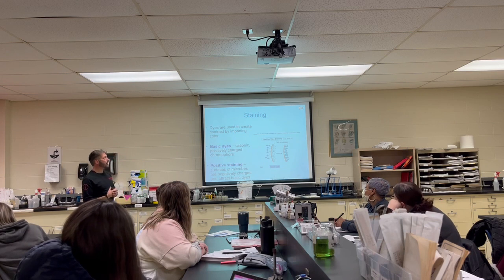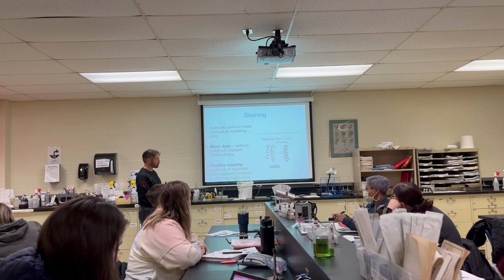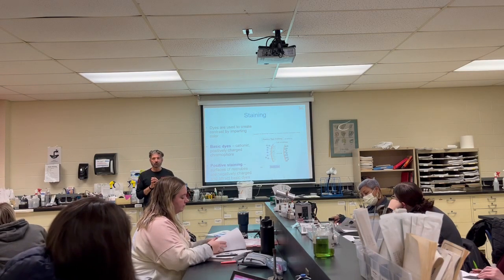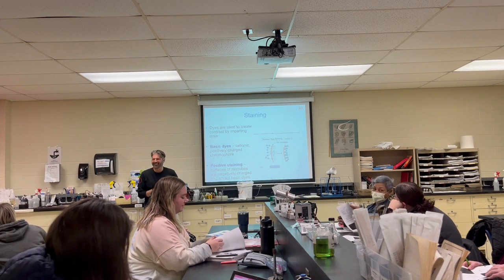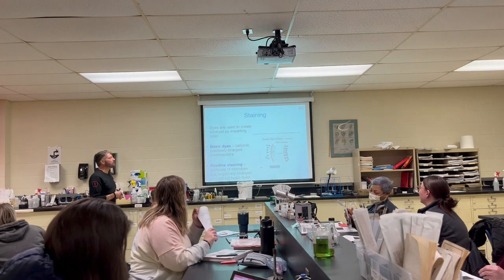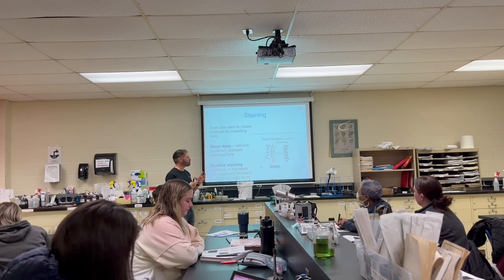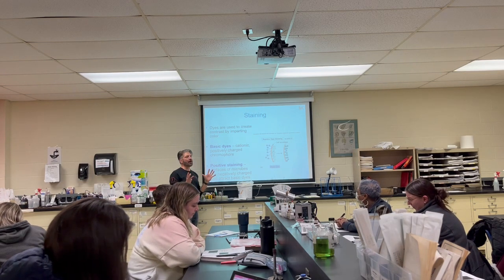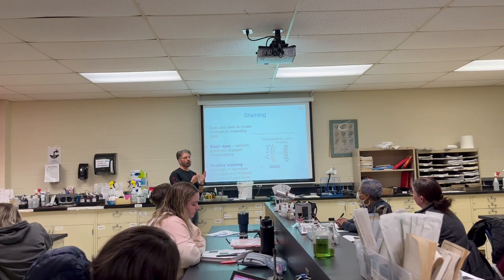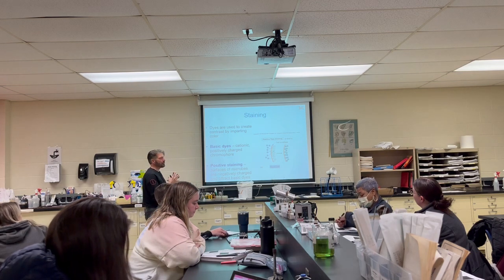Staining: dyes are used to create contrast by imparting color. Everyone loves chemistry in here? No? Just basic chemistry. In here, we're just going to use the premise that positive and negative attract. Anything with the same charge should basically repel, and anything with opposite charges should come together.